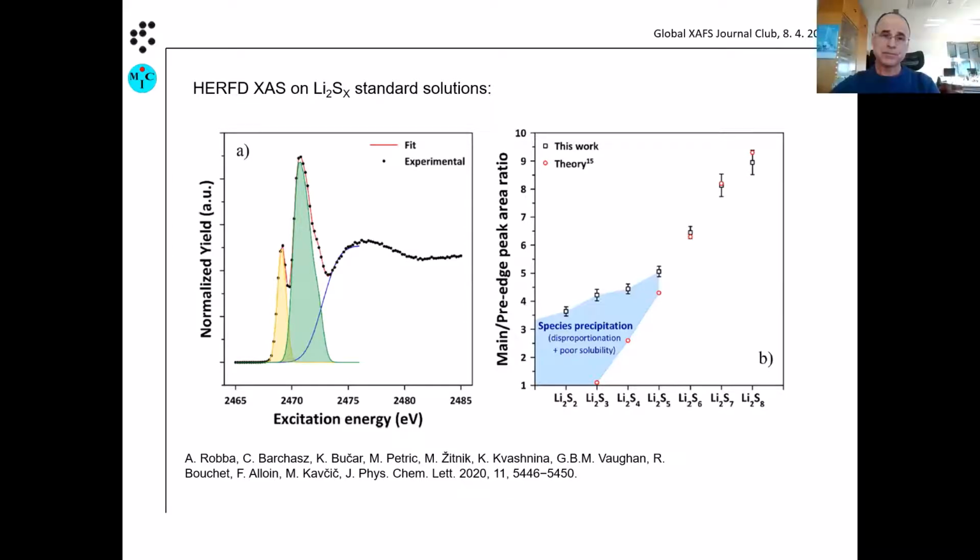Yes. Do you always use it in dispersive mode, or did you also compare it with scanning spectra? No, we always move the sample inside, so there is always a dispersive mode of operation. That means we always use a CCD camera as a position sensitive detector.